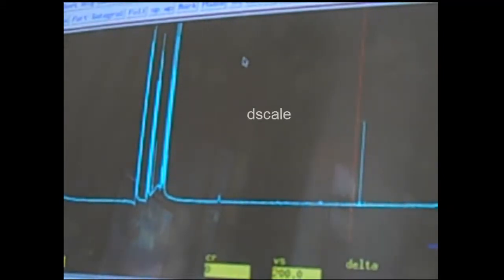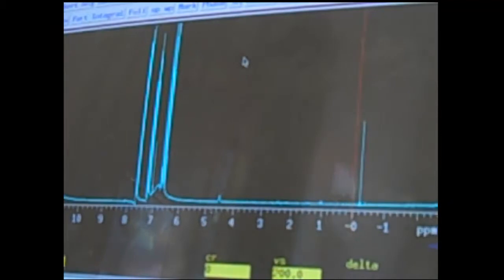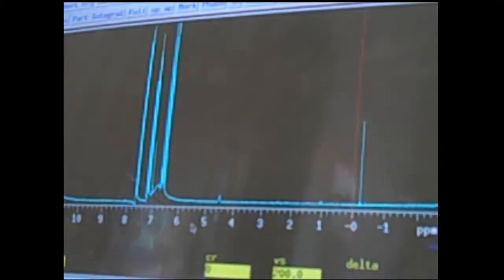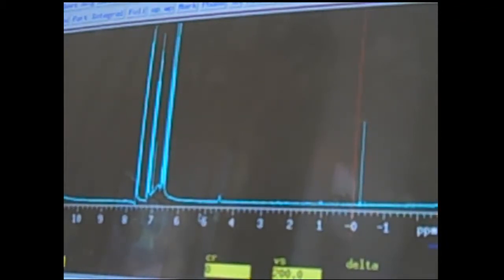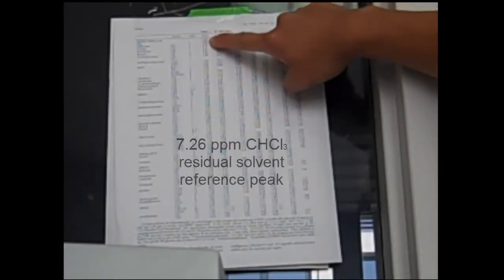Now that your spectrum is auto-phased, the next thing you'll type in is DScale. That displays the part per million scale on the x-axis. Next you'll need to reference your x-axis scale using either the TMS peak at zero or preferably the solvent peak. Up above the NMR there should be a piece of paper that gives the values of where specific solvent peaks will show up. For chloroform, which is what we're using, you'll see a CDCl3 peak at 7.26, and that's what we'll be looking for to reference on our screen.